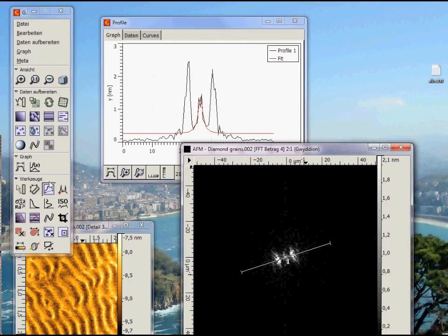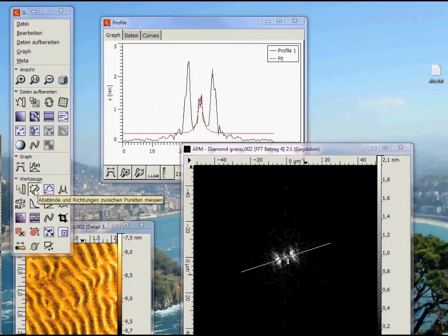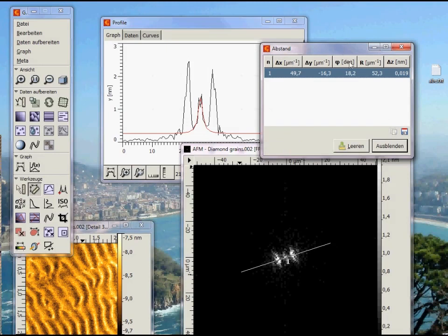Clicking on this button also gives us the orientation and angle of the line. The tilt of the line is 18 degrees, which is the orientation of the waves.